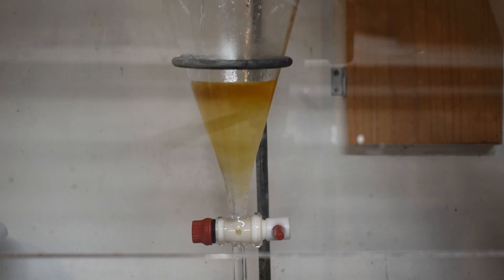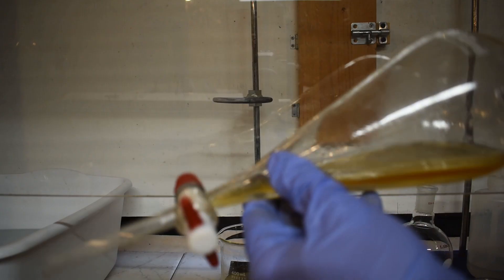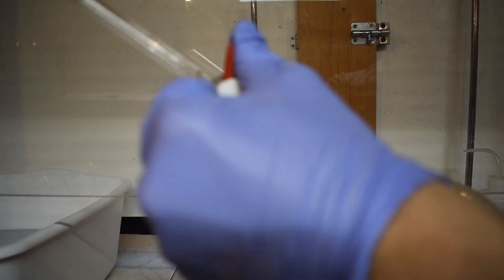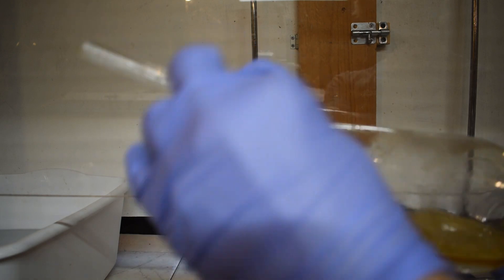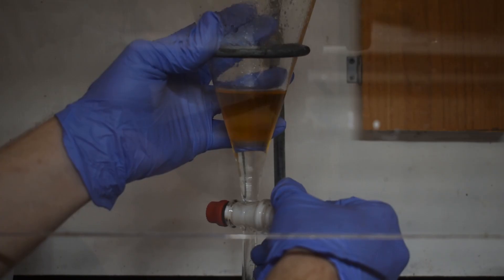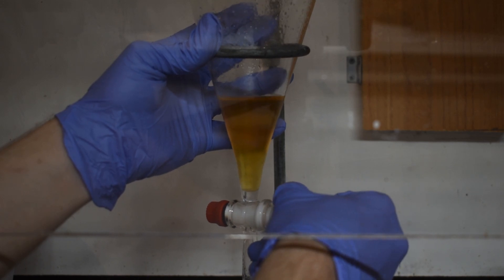To our isoamyl acetate, I then added a sodium bicarbonate solution and shook it around a little bit to remove any leftover acids there may be. I again discarded the bottom layer, and we're now left with some isoamyl acetate that's obviously not very pure.